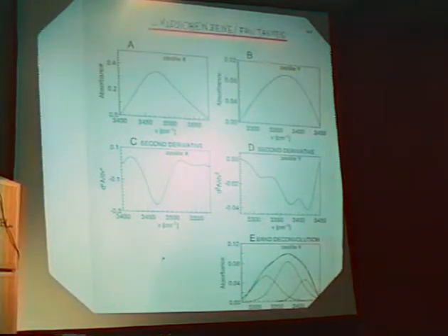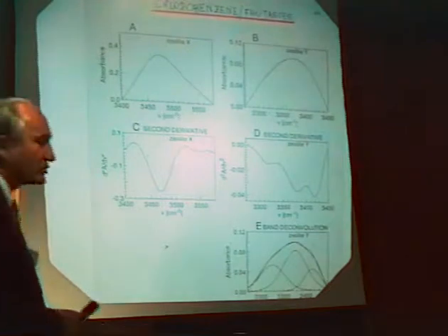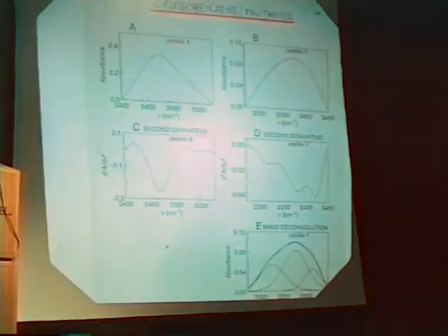So the results obtained with chlorobenzene sorption and also with the sorption of other hydrocarbons, other molecules like benzene, toluene, xylene, fluorobenzene, bring to the conclusion that in X zeolite we have homogeneous hydroxyls like expected, and in Y zeolite then we have three kinds of bridging hydroxyls.